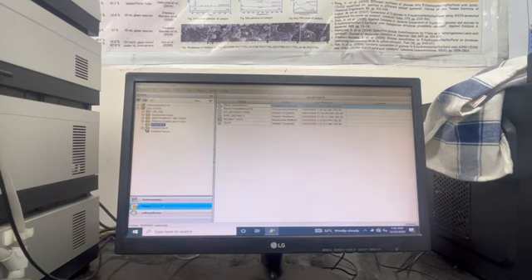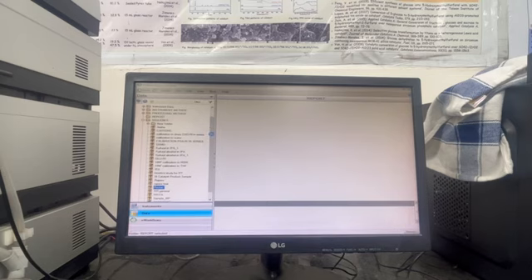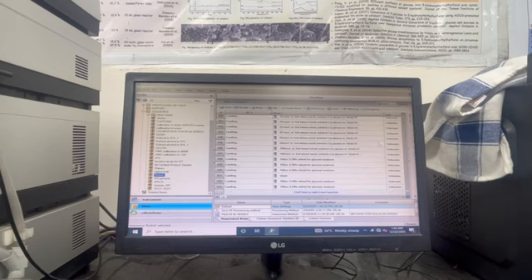On the data, we have the sequence, right? So for example, I will go to mine. Okay, then what I will do, I will give it a name. Now it's a little slow because a lot of data is there. Okay, so it will open like this, the sequence. You can right click on the right corner and say bottom, so you can quickly navigate.